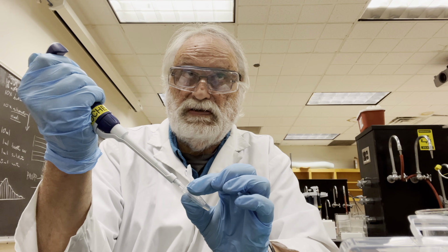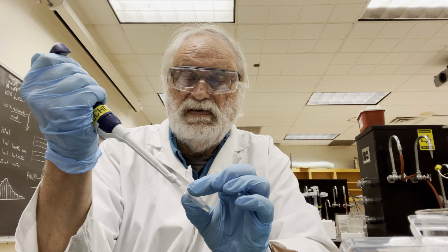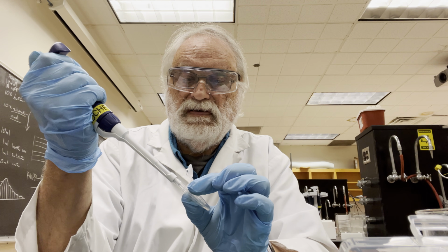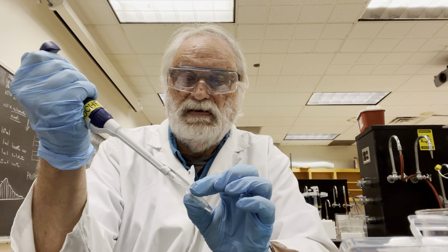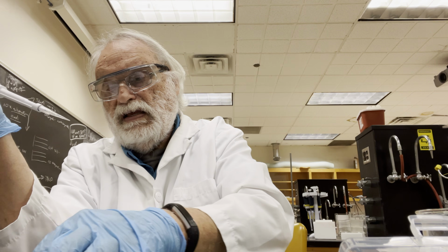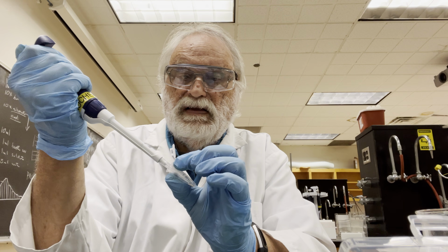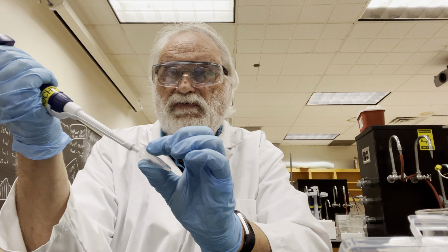So this is the 0.0625 sample. Take 50 microliters out. And then we'll add 50 microliters to the last tube. And we won't be withdrawing anything from this one.